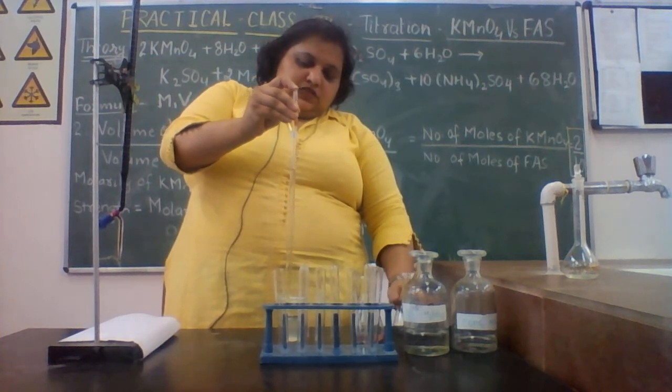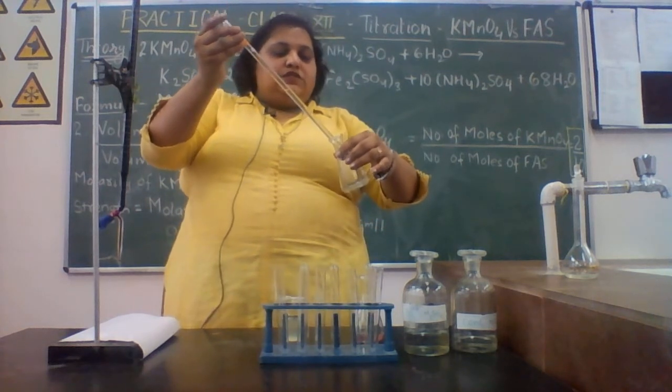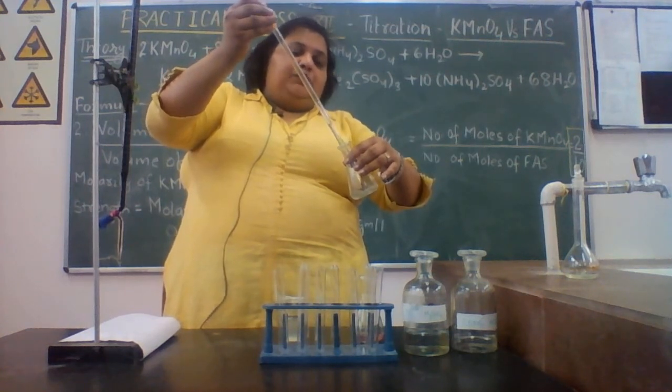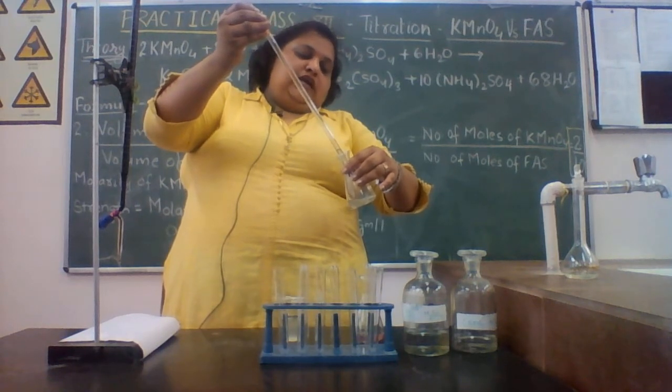At this instance, you transfer it to the washed and rinsed conical flask. The pipette works on the theory of atmospheric pressure.